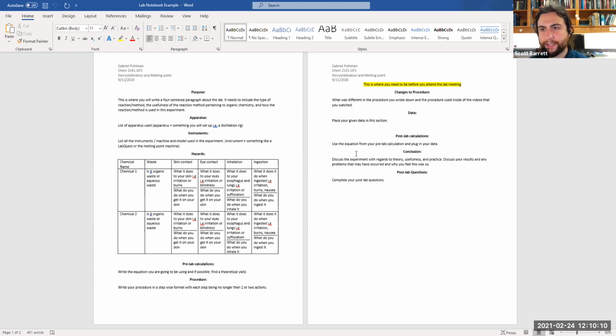And this is possible within a reaction. Maybe something happened in the reaction and you just got a really low yield. The recrystallization step is low yield just because that's your low amount of pure sample that you received from the reaction. So it is not something that really has to do with the recrystallization, unless you did it improperly, as it is more so the step before it.